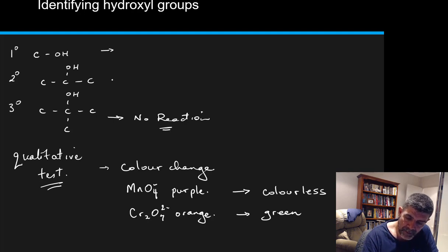If we have a primary or a secondary alcohol, then we will see a reaction. We will get a color change for both.